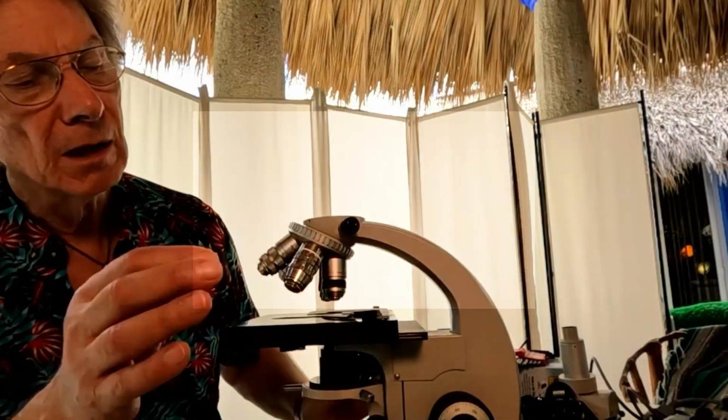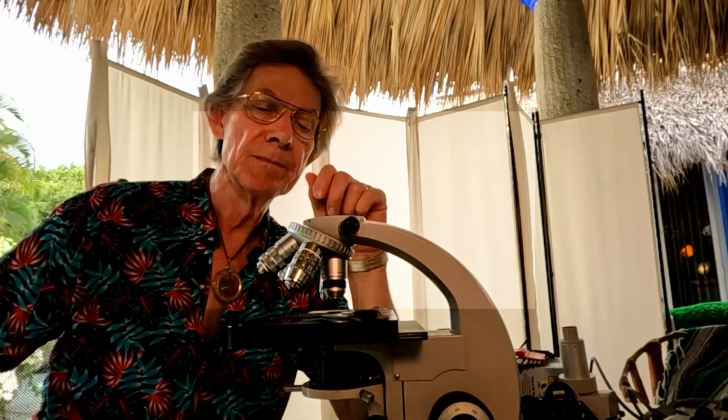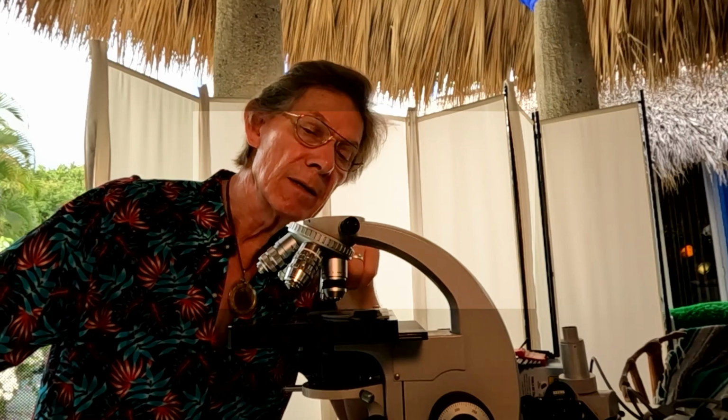There are different names for these, but just so you know and you can research it yourself, I use Plan Apo. Plan means flat field, and Apo is a description of the actual optics and the color resolution of the lenses. To give you an example, this particular lens right here is actually a Nikon lens, the others on this scope, there's a Zeiss one here, the others are Olympus, and I mix and match with lenses because they all fit the microscopes, and there are different qualities of lenses, so I mix and match what I can.